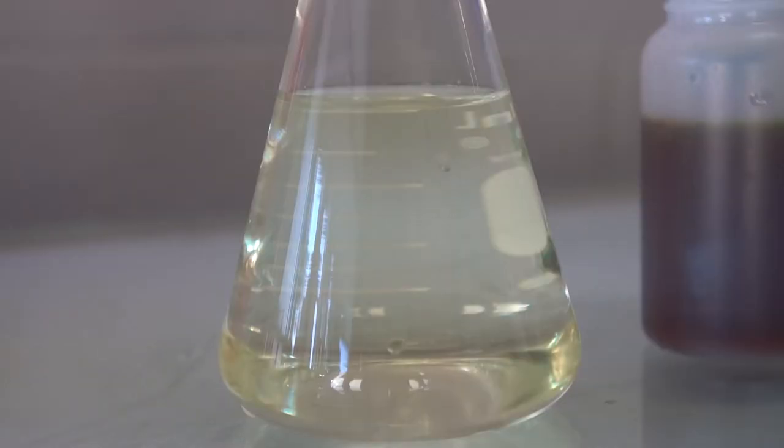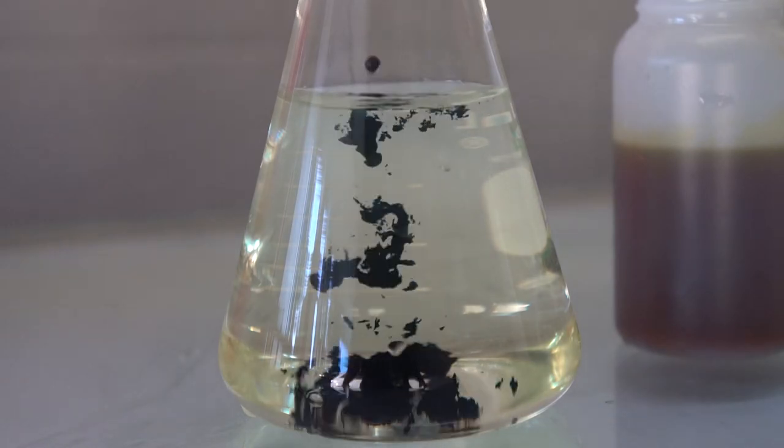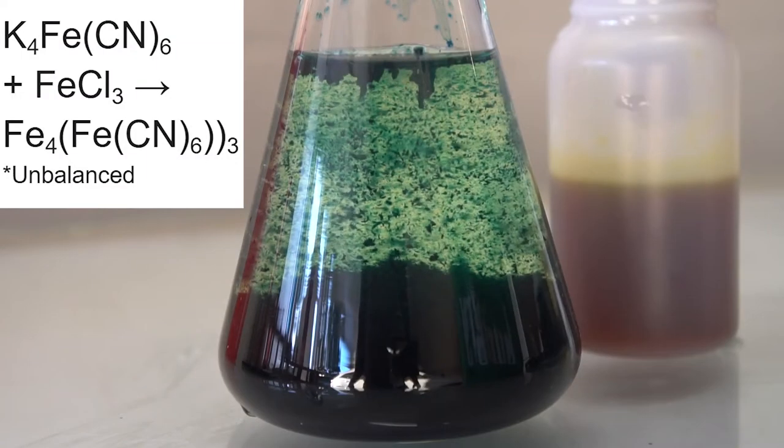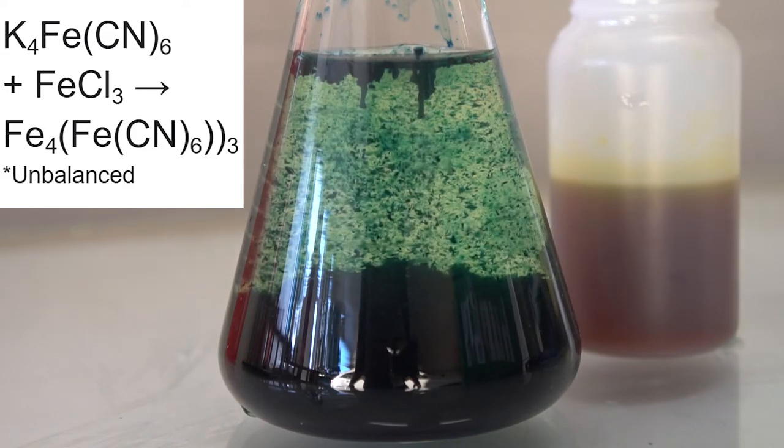You see it's a nice reddish-brown rust color. We add in a few drops - whoa, look at that blue! That's really cool. Dark blue ferric ferrocyanide precipitates out.